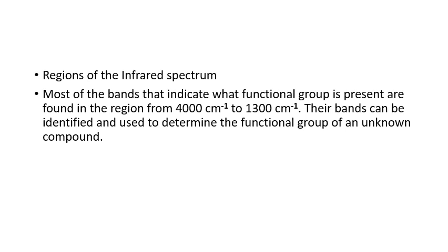There is a list of functional groups and it is known where each functional group may be present. When we get the output curve, using the absorption peaks, we can check the presence of various functional groups.